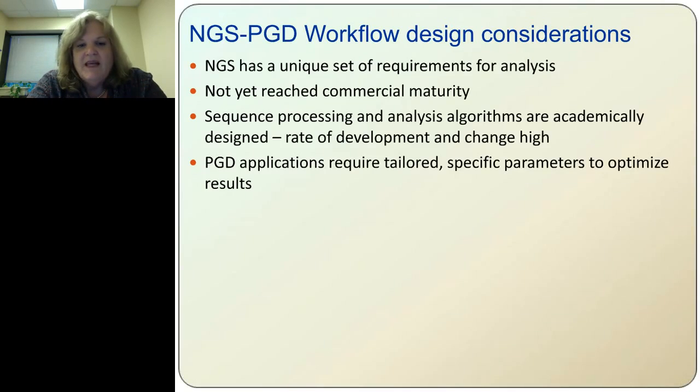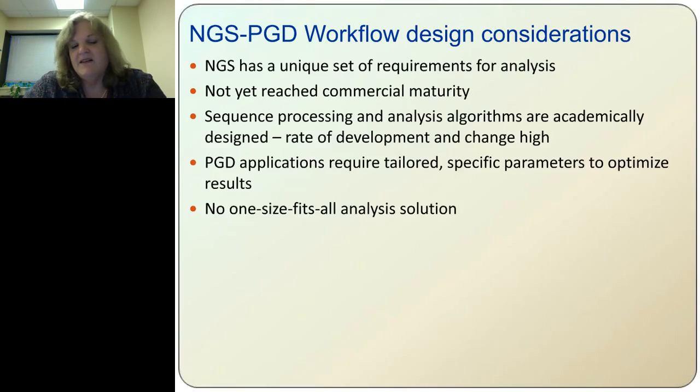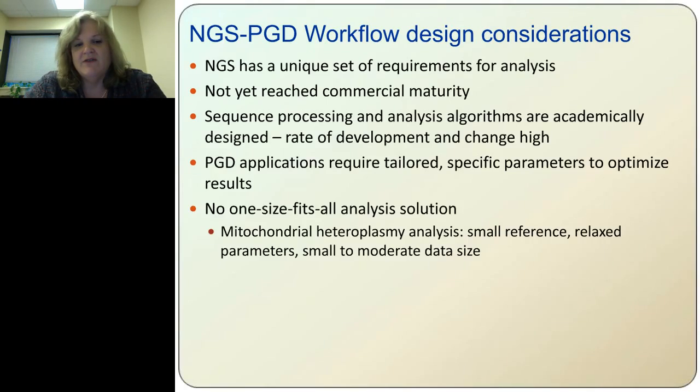Now, PGD applications really require tailored specific parameters to optimize the results of next-gen sequencing. It's not as simple as just throwing it against a reference and seeing what you get out. There has to be some statistical analysis that's not necessarily going to come directly out of academic or commercial software. So you're going to need statistical analysis support from a good statistician with experience, especially if you're doing methods development. And also, there are no one-size-fits-all analysis solutions.